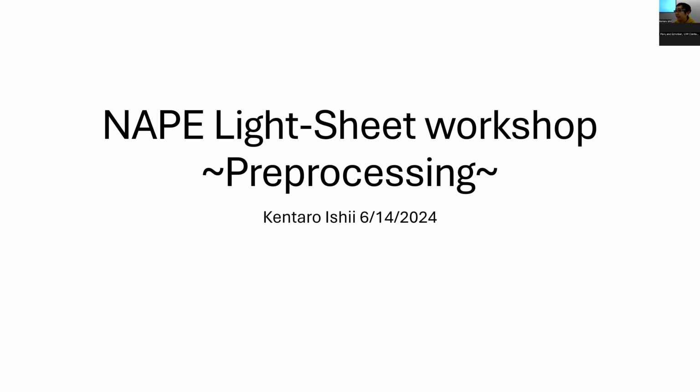What's also challenging is that you can't parse out one Z slice and do something like that. You have to handle it as a whole. It requires a lot of memory on your machine. It's not like you can just put it on ImageJ and check it. You can't even do that if you don't have a good machine. So the challenge to extract something out of that very massive data is what we're going to be talking about today.